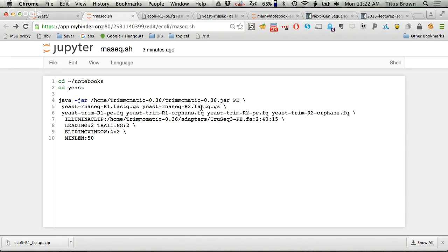What you really want, this is actually my wife's favorite comment, is to be in a situation where 6 months down the road, when you've been back in the lab doing a bunch of stuff and now you're coming back to do your sequence analysis, you know what each of the files sitting in your directory is when you look at them. If you have to email somebody to figure out what they are, I will tell you that you of 6 months ago does not respond to email, right? So you want to have really clear, excruciatingly long and detailed file names so that you can look at them and go, okay, Lisa trimmed this file on February 15th with these parameters. Maybe not quite that long, but something that really clubs you over the head with your file.